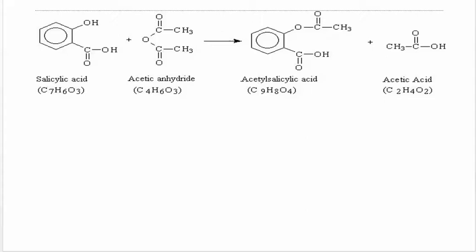So for the aspirin lab, what we have is salicylic acid reacting with acetic anhydride, and we form aspirin, acetylsalicylic acid. So that's aspirin.